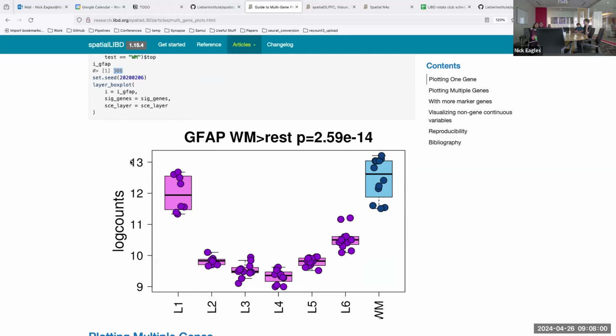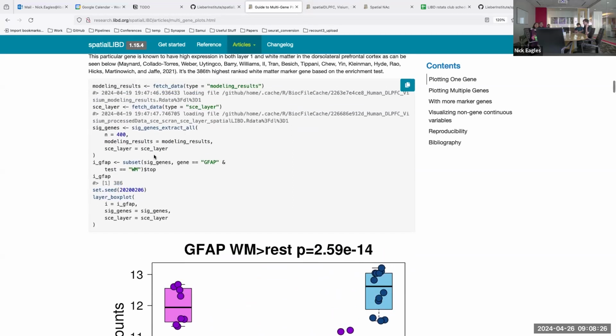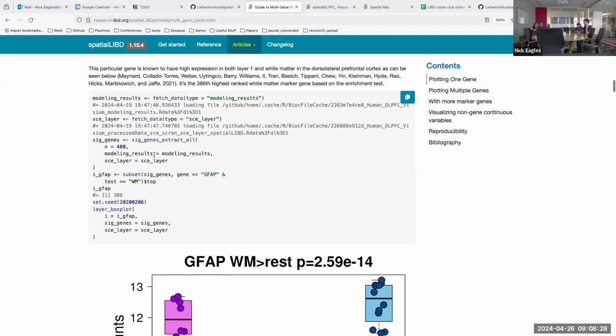This is related to what Louise showed in her talk, where if you do a 1 versus all strategy, one problem is that sometimes the second highest expression is pretty considerable. You wouldn't see that in the mean ratio method, for example. Nevertheless, it is a popular marker, and it does do well on the 1 versus all test. But this is another example where sometimes it's good to check in a data-driven way how your marker performs, because sometimes you can find markers in the literature, but they're not necessarily the best for your particular data.